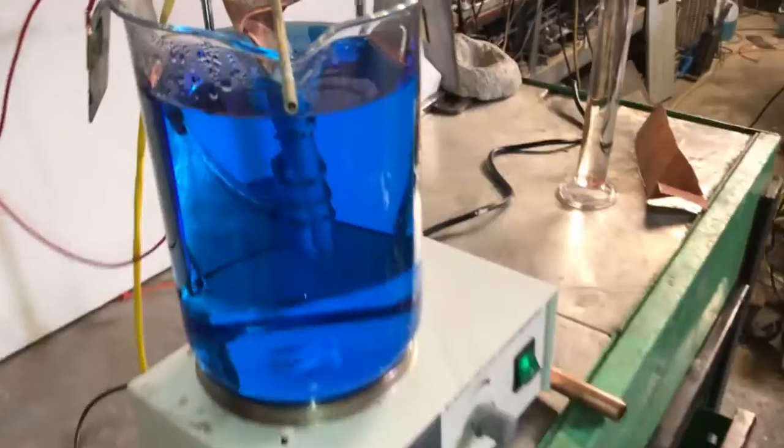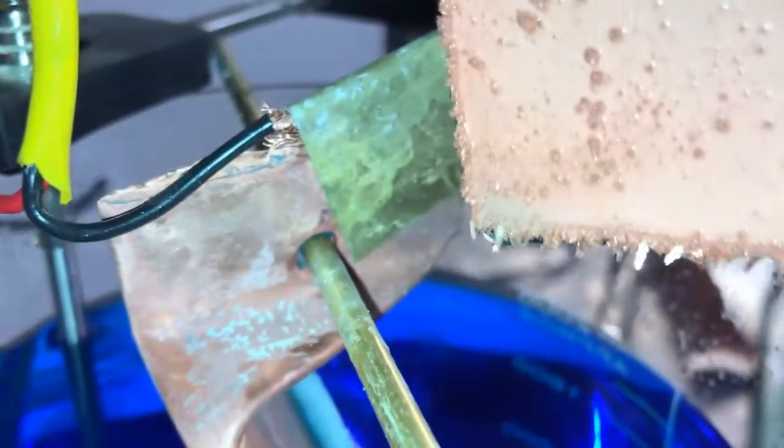But those cation flows are a pretty amazing thing. They're very fast. This is real time, and you can see they've got a pretty good velocity to them. Okay, so I got some very strange crystals going here all of a sudden. Man, those things are reflective, shiny. That was right after the periodic current reversal. So I think the iron may be starting to come out. Look how freaking shiny those are.